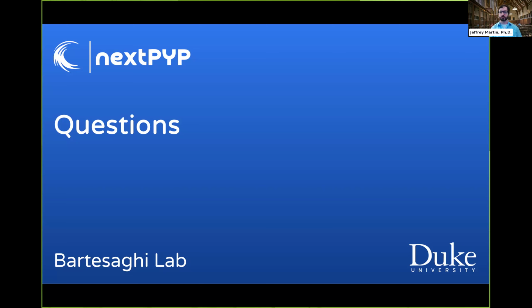Yep. All right, and I think we have time for one more question. We'll do a short one. So roughly how often do we update PYP was the question. How often are upgrades available? I think so far we've been putting out new releases with feature additions and bug fixes every few weeks. I think it's been our cadence so far. I think we intend to keep up with that as much as we can. So I expect to see new features and things delivered hopefully fairly quickly.